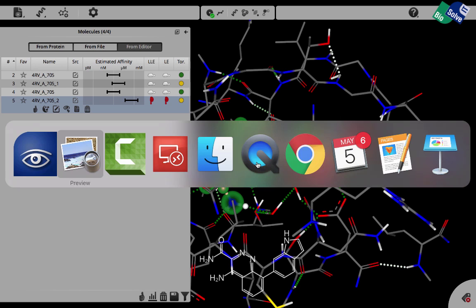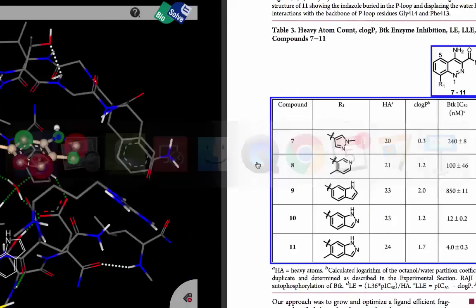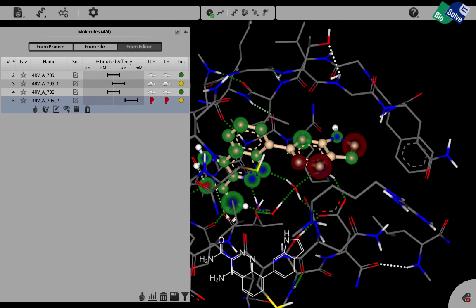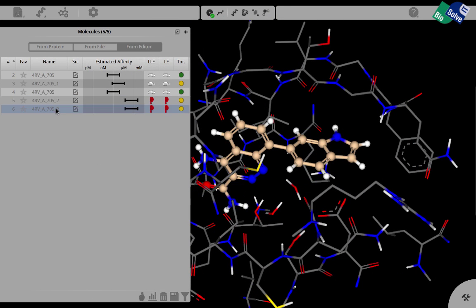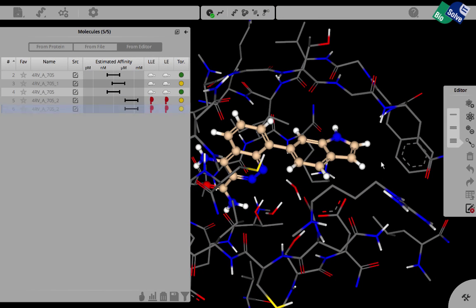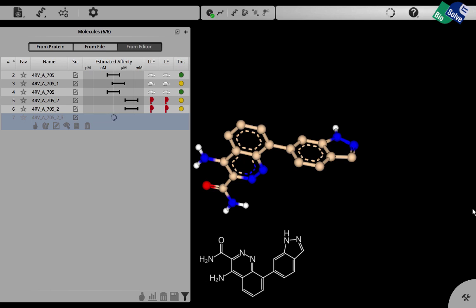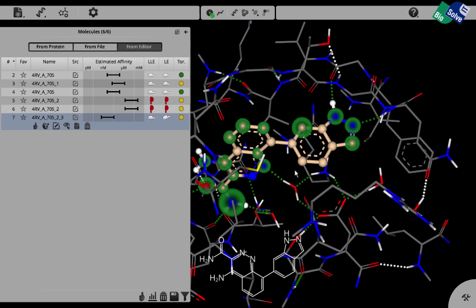The next thing that Takeda did was modify the indole ring into an indazole ring, which brought them a boost in potency. Let's see how we can do this here. Simply type N on the keyboard and then leave the editor again and calculate. This compound is optimized and then scored based on its affinity.